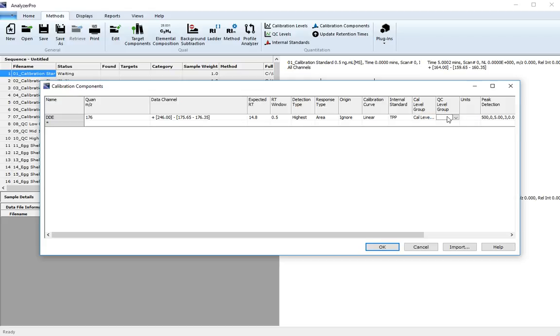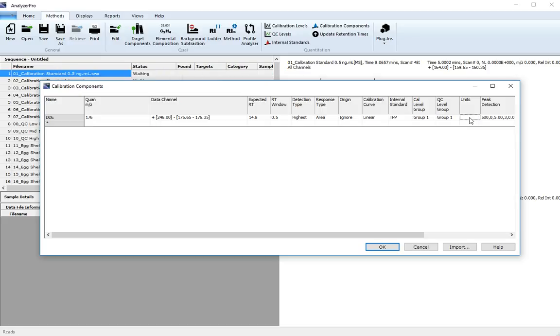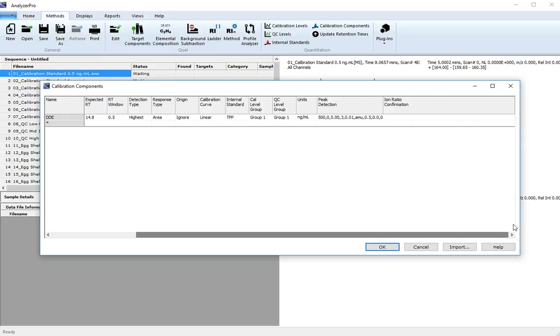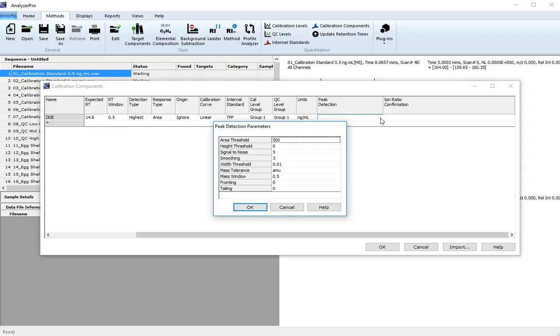And the QC level group is QC level group 1. The units are nanograms per mil, and set your peak detection parameters as we previously did for the internal standard.